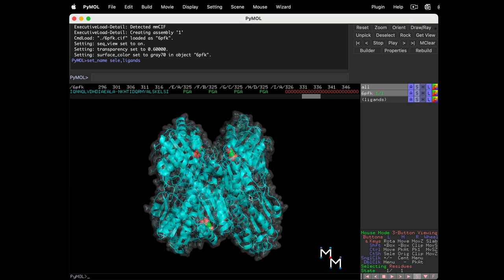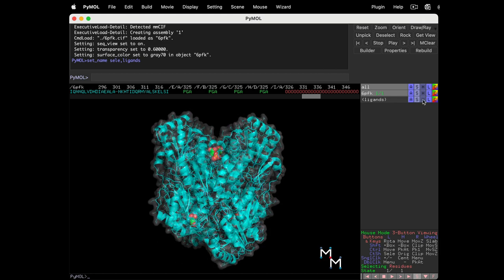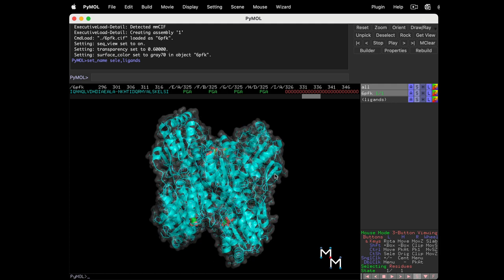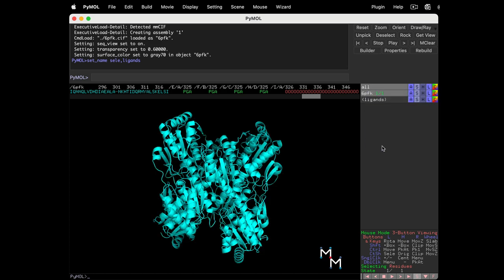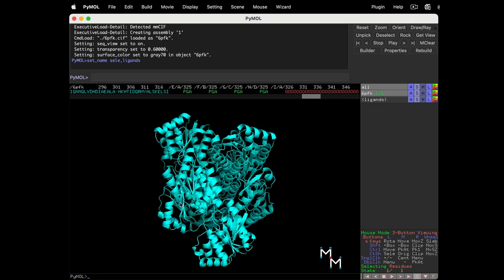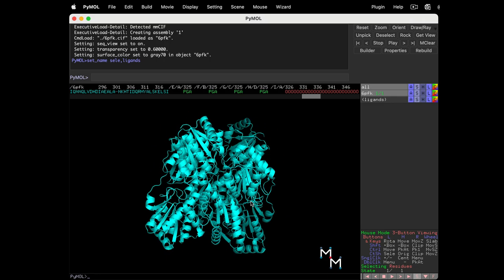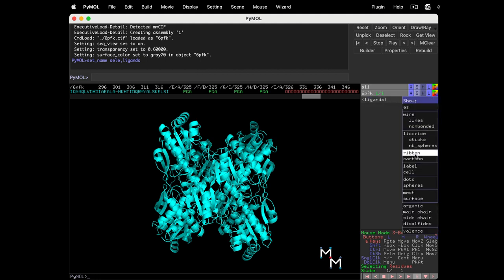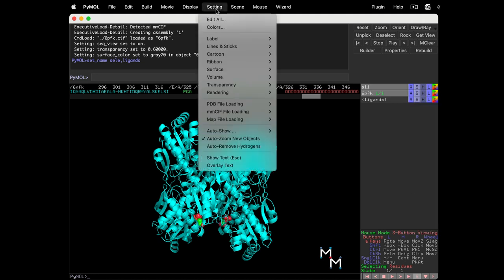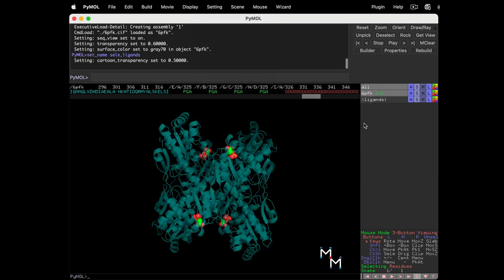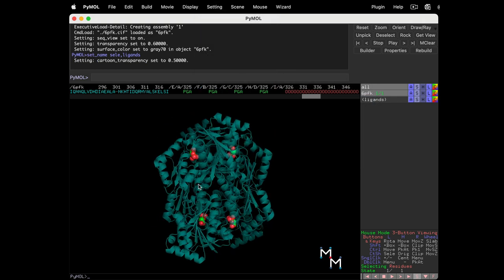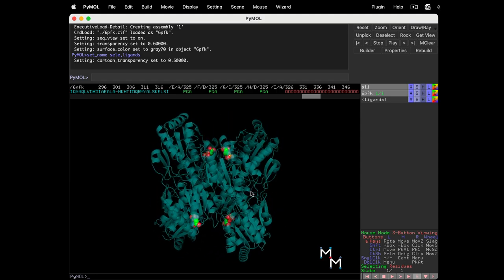The cartoon is another rendering that can have transparency. Let's hide the lines in surface, go back to cartoon rendering, and apply transparency. This is a good time to use show as. 6-PFK, show as cartoon. Notice this command cleared both the lines and the surface. But it also cleared the sphere rendering of the ligand. No problem, that's why we made a selection for the object we're focusing on. Next to ligands, S, spheres, to get the ligand back. Now, setting dropdown, transparency, cartoon, 50%. And now we can see both secondary structure and the location of the ligand.